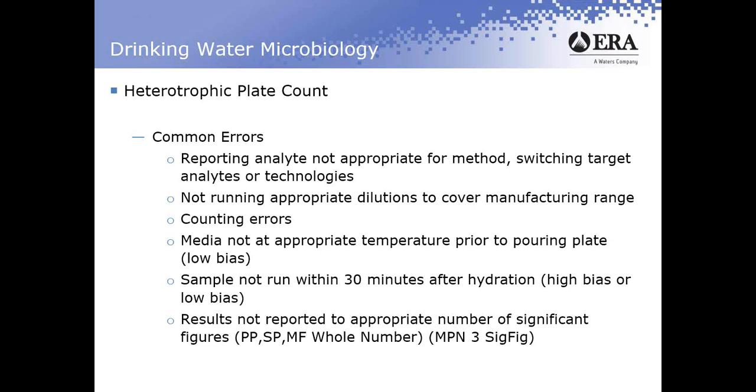This is probably one sample that has, within microbiology, one of the highest failure rates that we see, simply because of the non-selective nature of the test itself and the incubation period and the temperatures. It tends to produce very tight data.